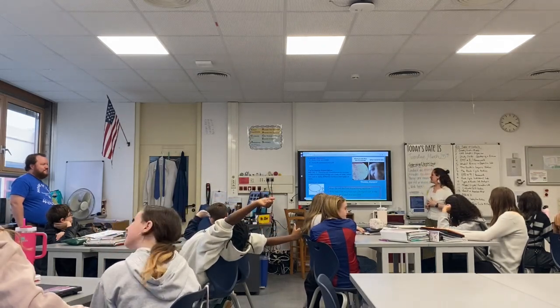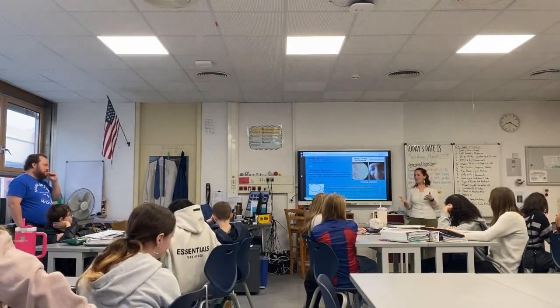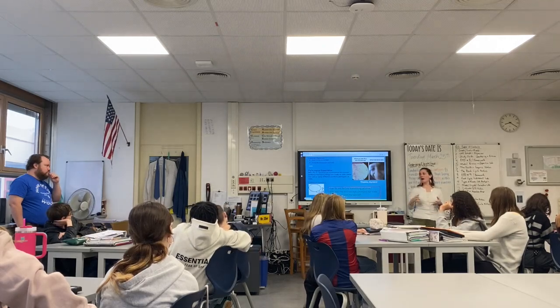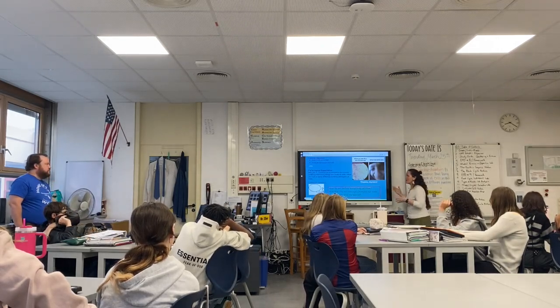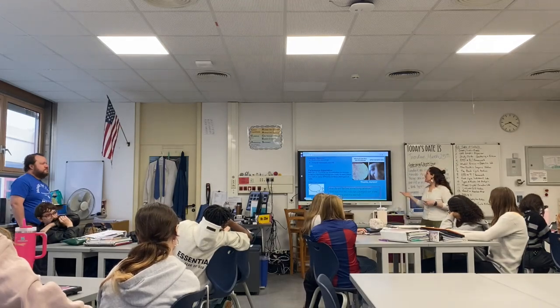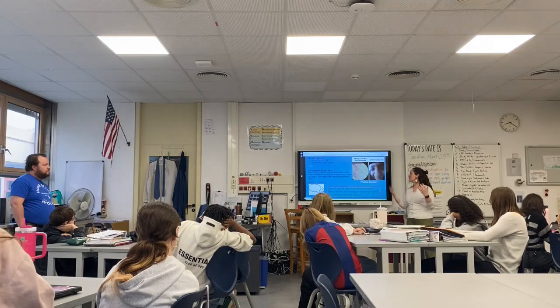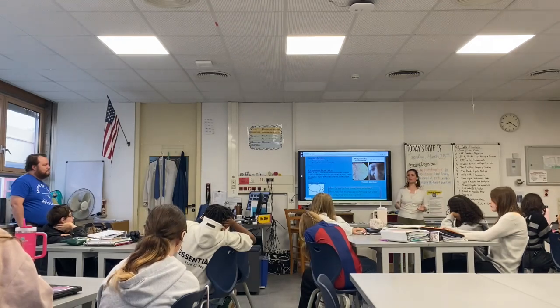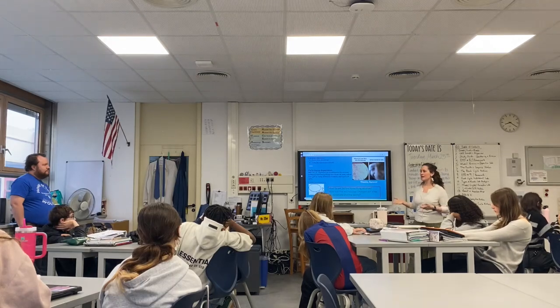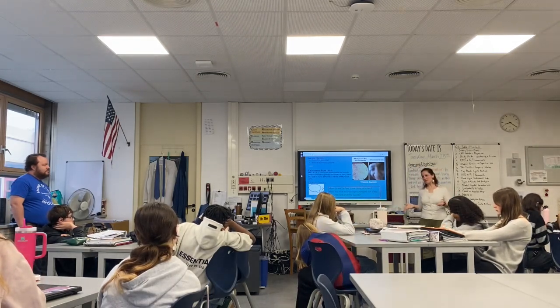Yeah. And the reason is because when we get back from spring break, we are starting the biology unit. So our learning objective is to conduct an investigation to provide evidence that living things are made of cells, either one cell or many different numbers and types of cells. So a microscope is a great tool to be able to conduct that investigation. So today we are introducing ourselves to the microscope.